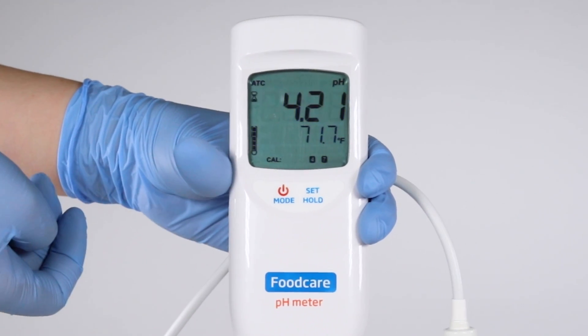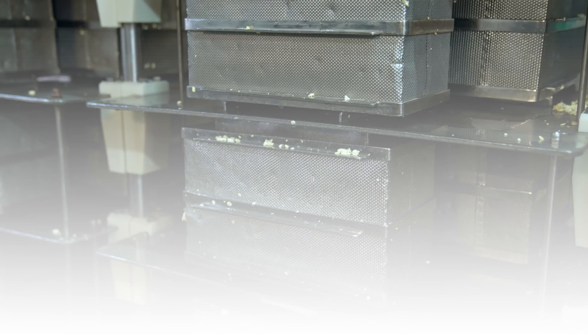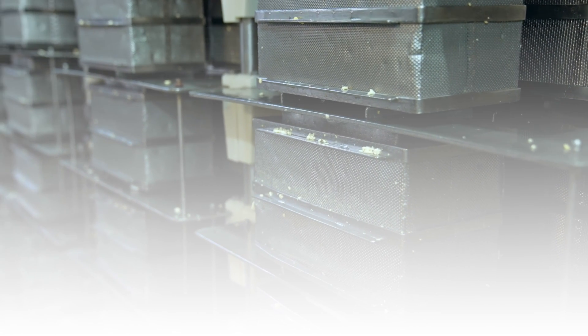Real-time results can flag when a problem arises right away, preventing unnecessary waste of product and time.